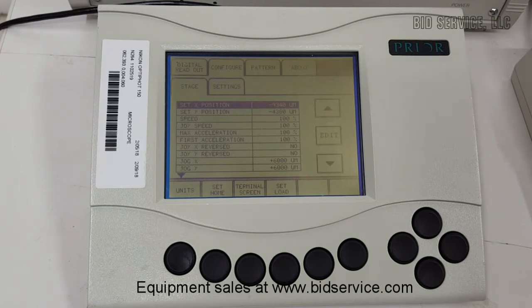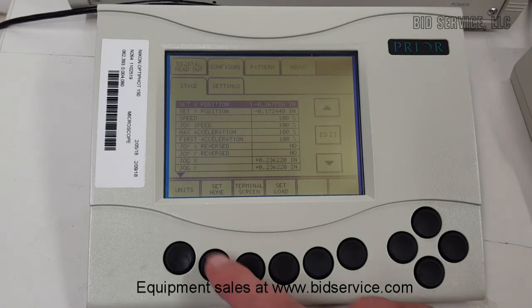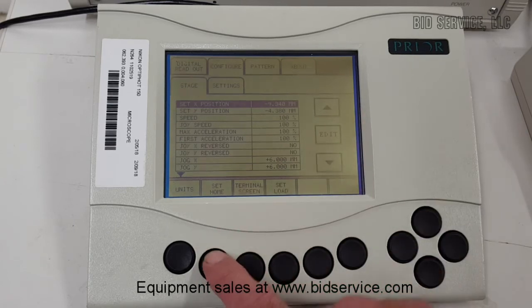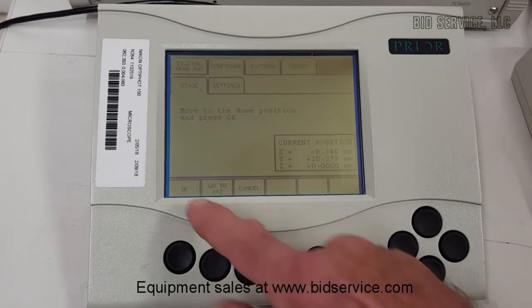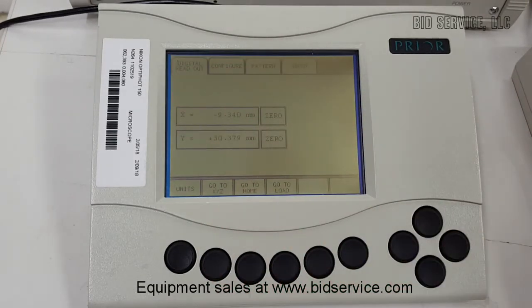Here's the configure screen. I also have the manual. That's the units — inches, millimeters, microns. Set the home point. Move home position and press OK. So if you want to change the home point, that should be the new home point. We'll give it a try. Yeah.